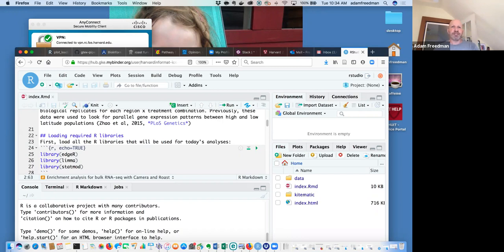We also, in our previous workflow, talked about using pseudo-alignment-based tools like Kallisto-based pseudo-alignments, to use sleuth for differential expression testing. Later, I'll explain that we can import sleuth results. I won't do it, but I'll be able to explain how that works a little bit. But back to the tools.